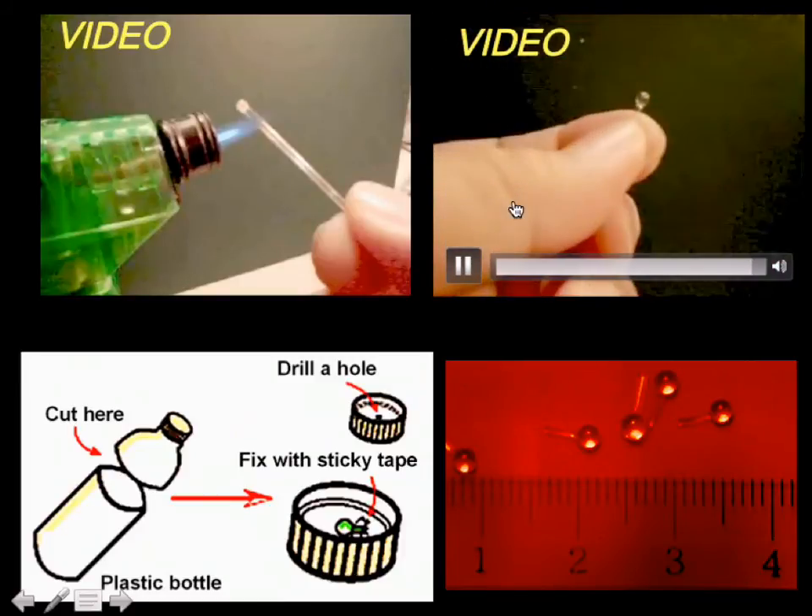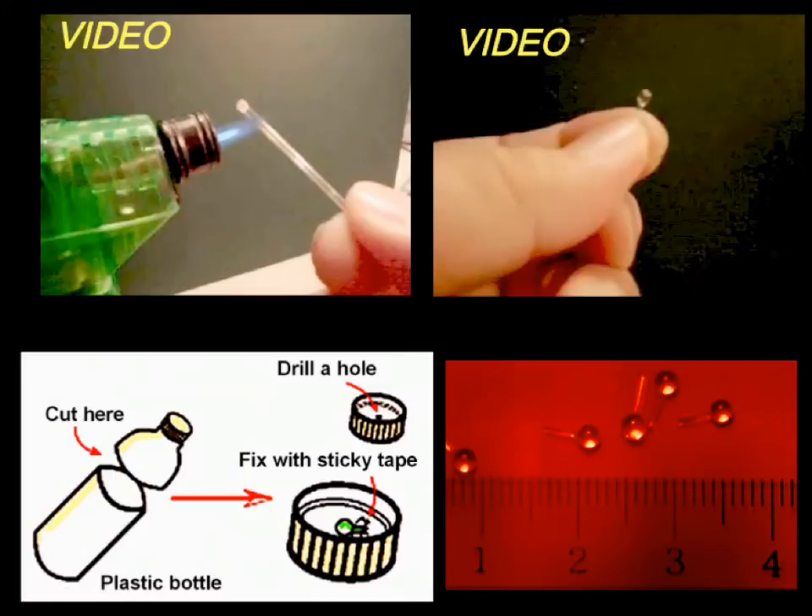Now fix it — this is my microscope. Use the water bottle. Cut here, use the lid. Make a hole and fix the lamp. This is the lamp, put it there.